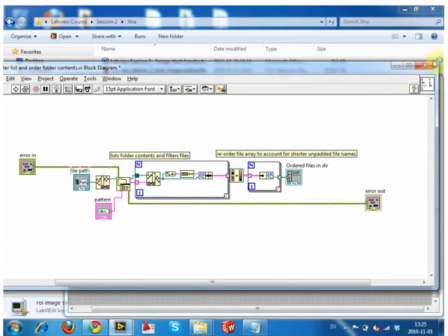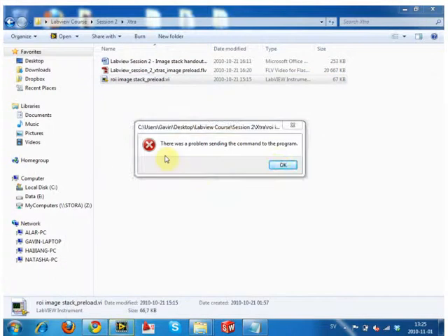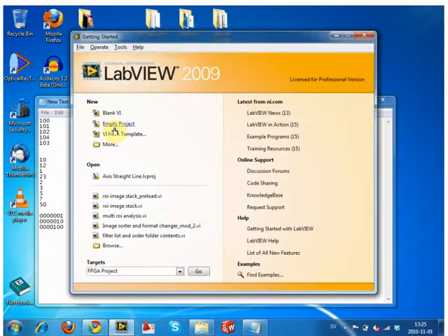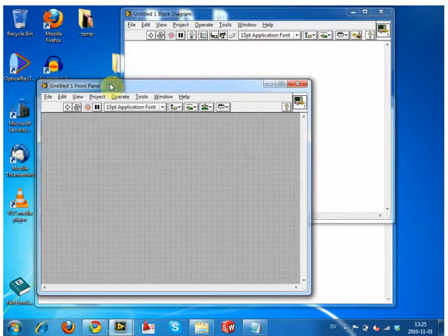So as usual, we'll scrap all of these and we'll make a new one. Okay, I'm going to steal your handout because I don't have mine with me. Can I borrow your handout? Oh, this one. So I don't put things in the wrong order for you.